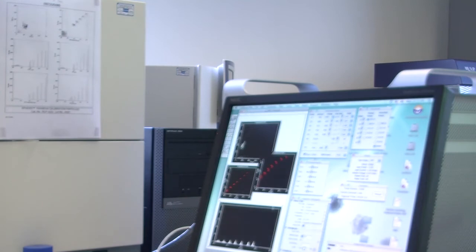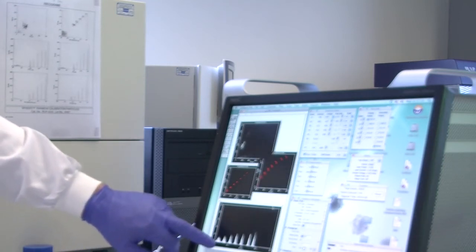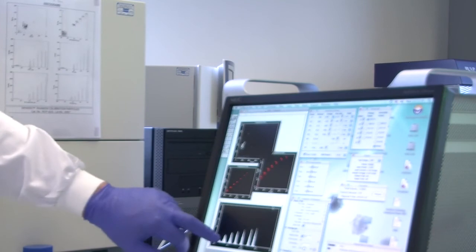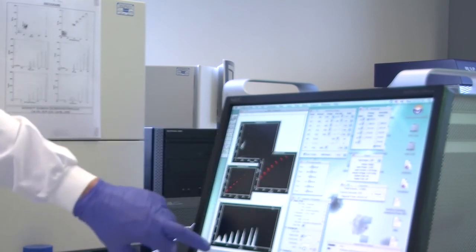Well, it's going through and going to waste. If we leave it on, eventually this tube will run out and it will dry out, and that's not good for the instrument. But we've got plenty in there at the moment, especially on low flow rate. So you can see these are 8 peak beads. 3, 4, 5, 6, 7. We've got 7 peaks. We've actually got some events on the left-hand axis?